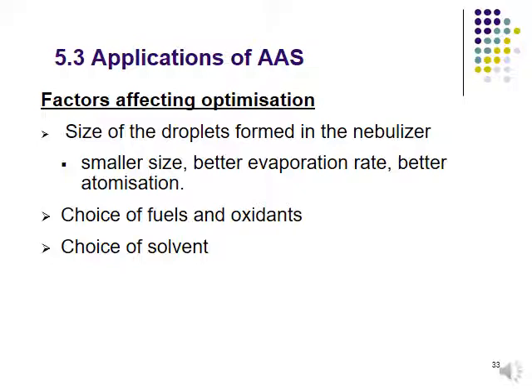Another one is the choice of solvent. There are many kinds of solvent. We have organic solvents, and from these you must know that there are certain solvents that are not easily evaporated. So it is advised to choose a solvent that is very light in formula weight and easily evaporated.